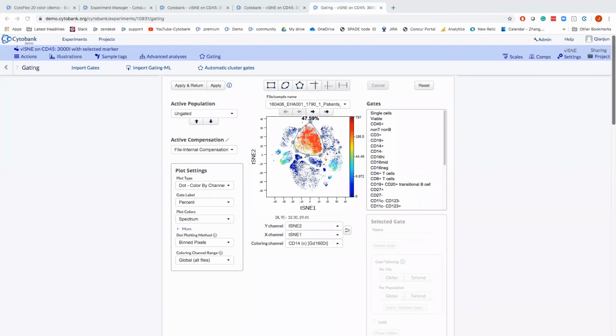Okay, great. That's a great question. UMAP, if you're not familiar, is another dimensionality reduction tool. Oftentimes, people will run both a version of tSNE like viSNE and UMAP and see how they compare, because they can give you slightly different messages about your data. In general, the consensus is that a lot of the time UMAP runs faster than viSNE, and it can be better at representing the global distances. So on a UMAP map, points that are really far away from each other will mean more than on a viSNE map.